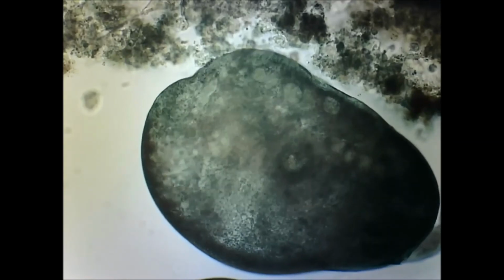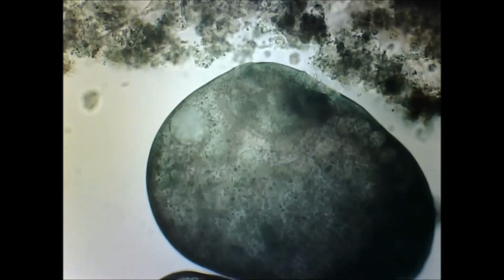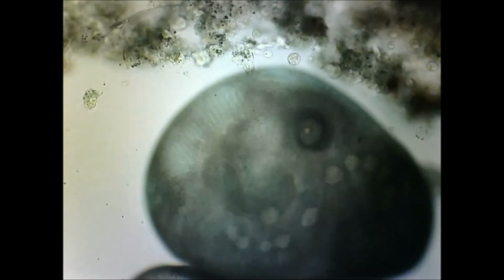Here you see an extended bulbous Stentor. You can see the nuclei really well here, as well as the buccal funnel again. And we'll do another episode on Stentor.